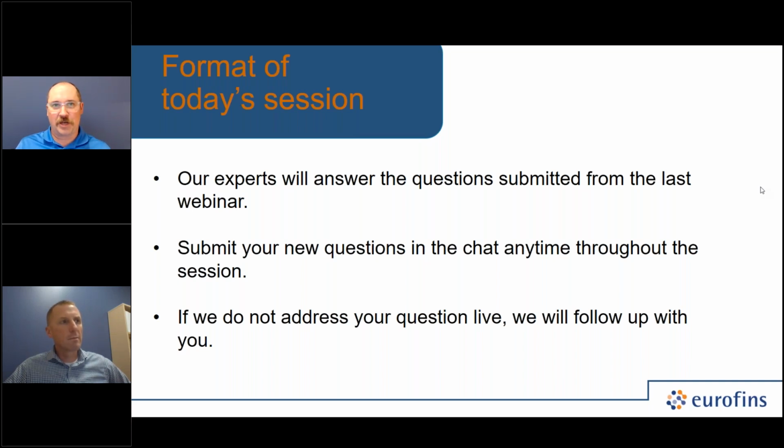It poses a lot of challenges, and it raises the question as to, when you're formulating a product, if you need species or strain level quantification in a blend, are you going to pick the species that are going to be more easily differentiated by the tools that we have?